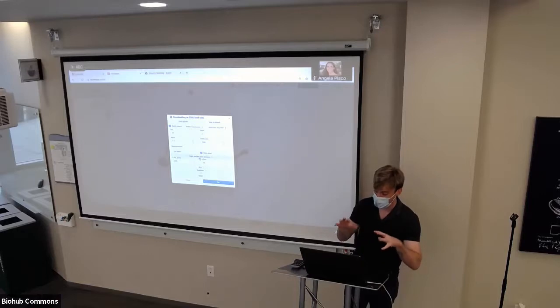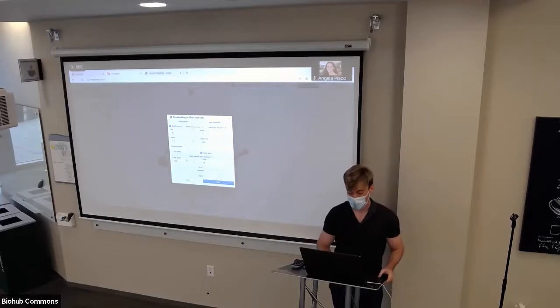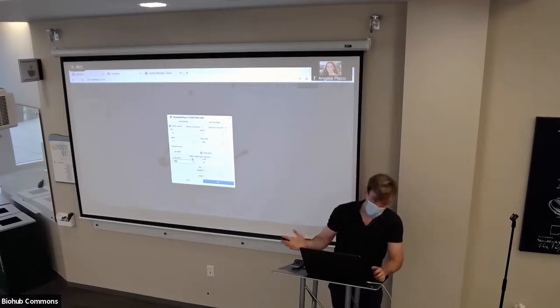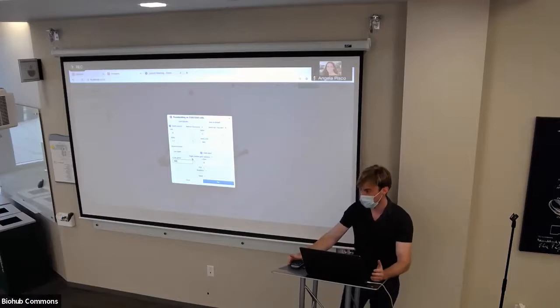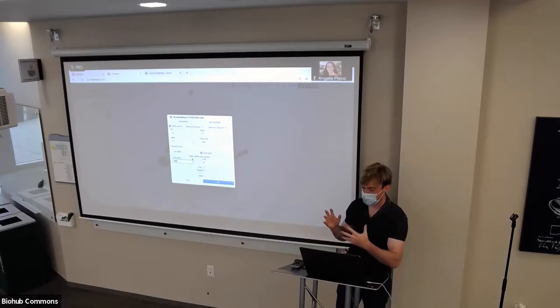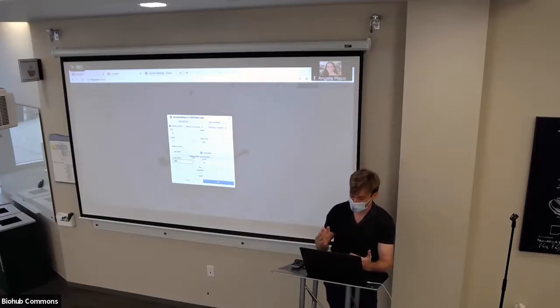All these tools are using this platform called ScanPy, which is a single cell analysis platform. It's like a hub of all these different analysis and pre-processing methods. And by default, they select genes based on their variability. In the beginning, variability was very basic. It's just variance. Then people discovered that variance is not enough because genes with high mean expression tend to have high variability. So then they do variance normalized by mean expression. But that behaves weirdly with a lot of zeros. So then they use regression models to approximate what the variability is, regressing out a negative binomial distribution, which models all these zeros. In the end, this takes care of all that under the hood.